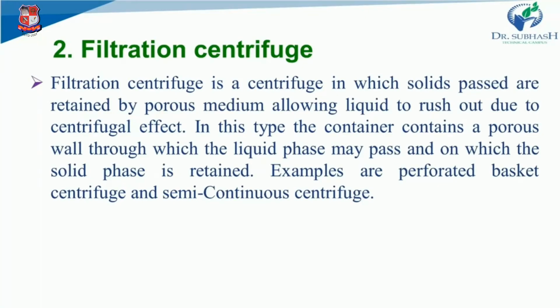Can you imagine any practical example which uses a filtration centrifuge? See, I am not recommending any practical examples here, but you can easily compare this type of filtration to a practical example, like whenever somebody is filtering tea, right?